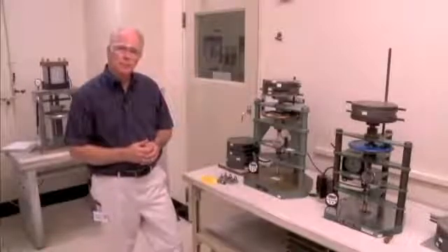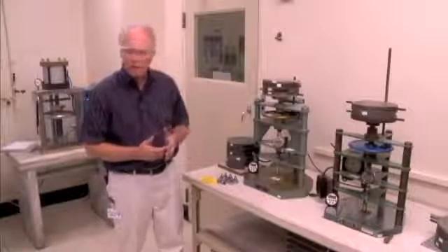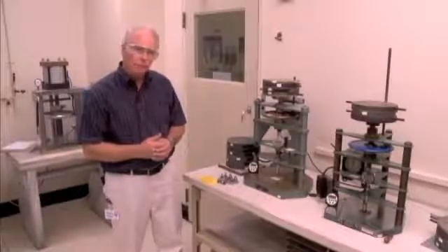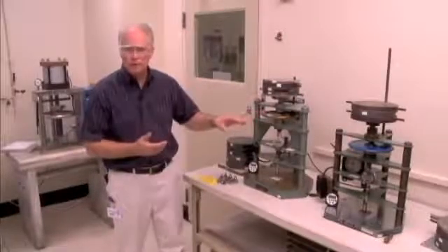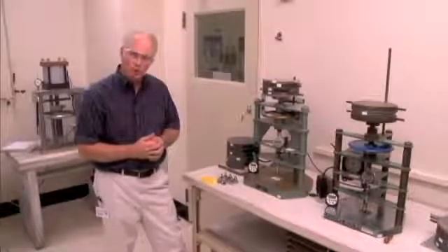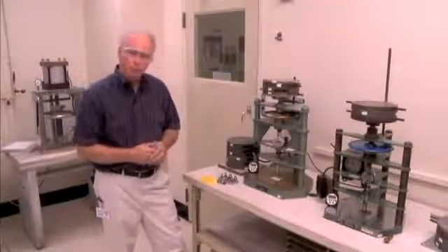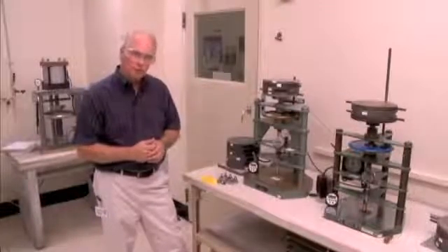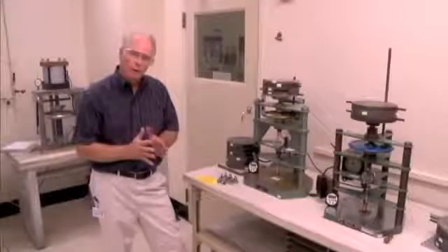Now, each flooring specification, because they're written for individual products, it might be VCT, solid vinyl tile, homogeneous rubber, linoleum, whatever. Each one of those will determine the parameters by which the test is to be run. Now, in the case of VCT, we're more interested in resistance to indentation than we are recovery. VCT tends to be very hard. And if the tile is too hard, it's going to be prone to breaking or cracking when it's installed. If it's too soft, it's going to be susceptible to indentation. So there's kind of a slot that you have to hit when you're evaluating vinyl composition tile.